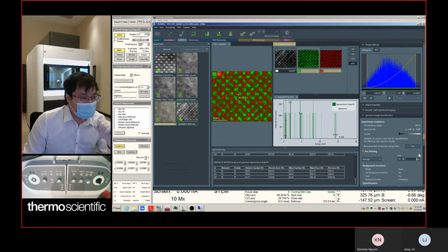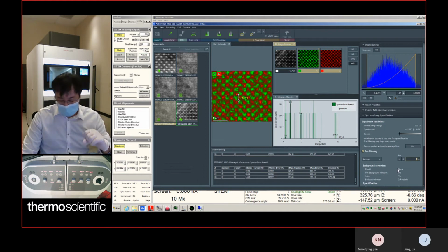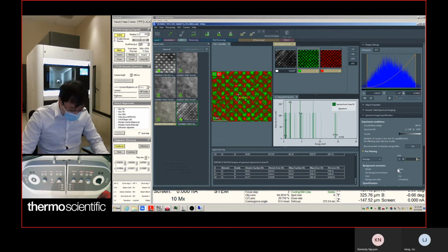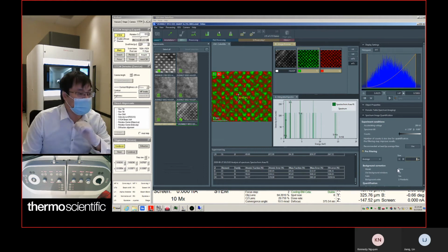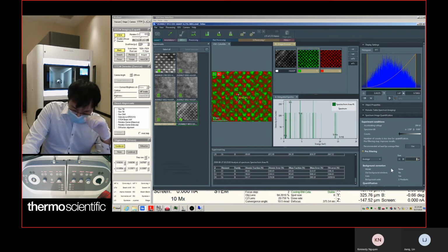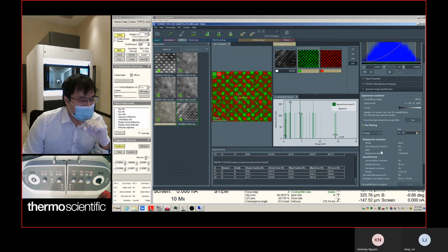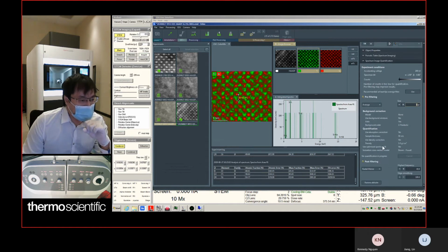So the size is just like what the filter is, and then it'll apply to the whole spectrum. Yes. Or the image. Okay. Yeah, you're right. And then what you did earlier was just checking the spectrum individually by size, right? Yes. When you were setting the pixel by itself. And then this is when you're actually applying the filter to the whole image based on the pixels. Okay.